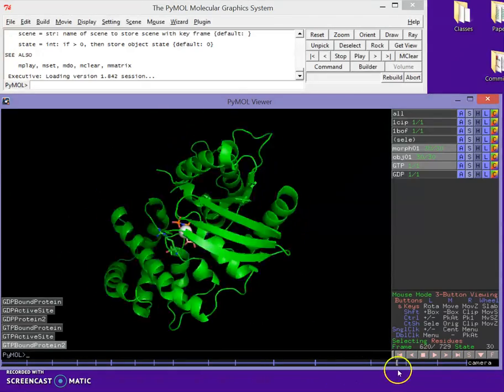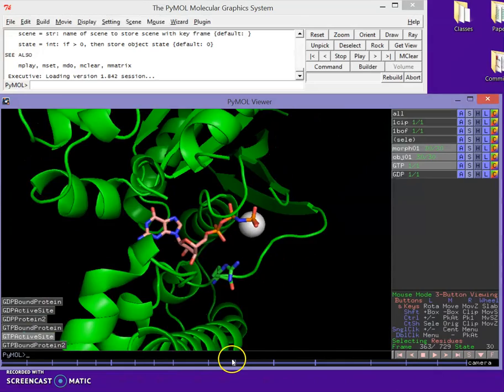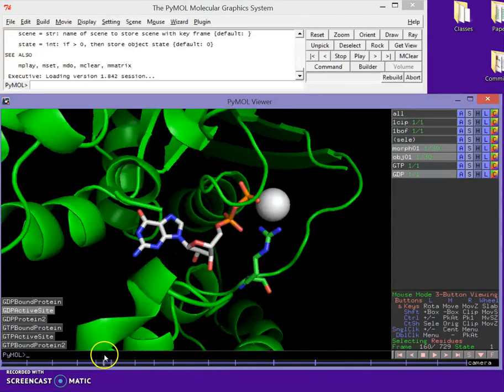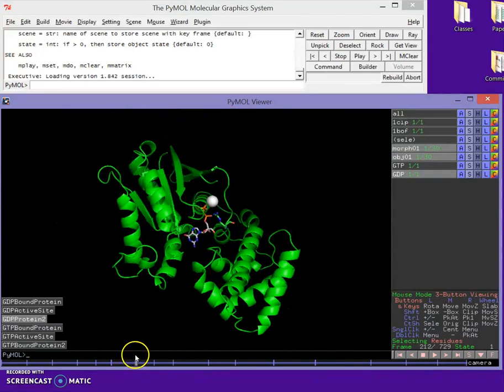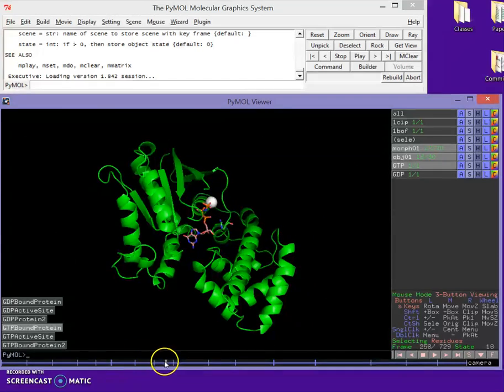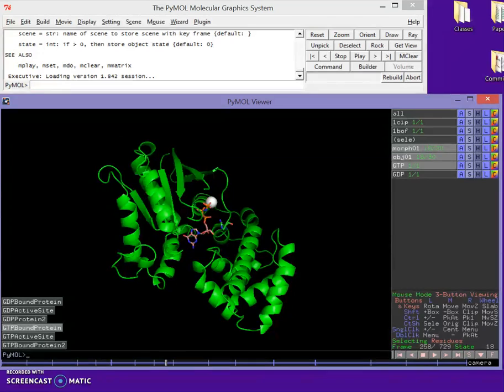So we made a movie of just changing the camera views and moving around. Now the thing we really want to do here is switch our ligands and have them fly in and out. Now this is the tricky part. So bear with me here.